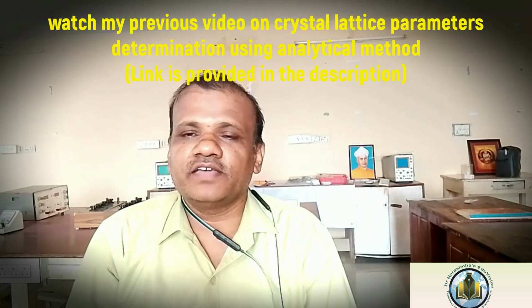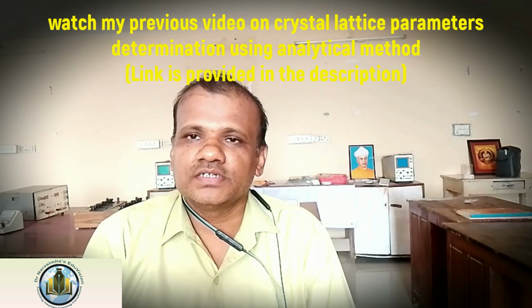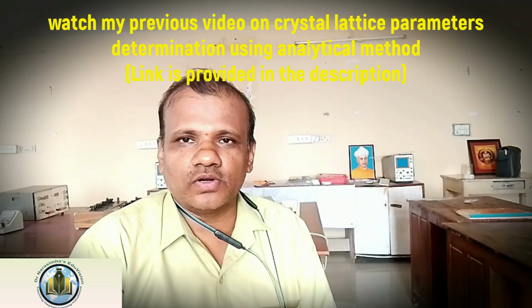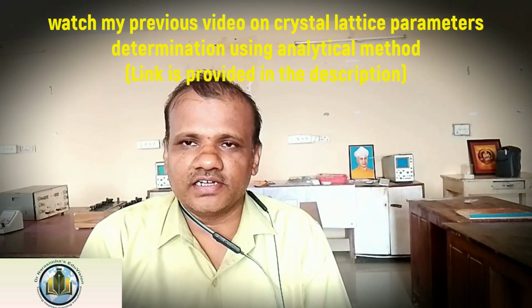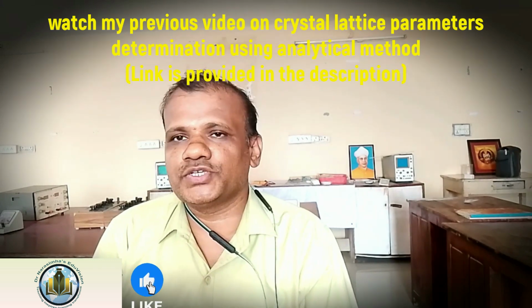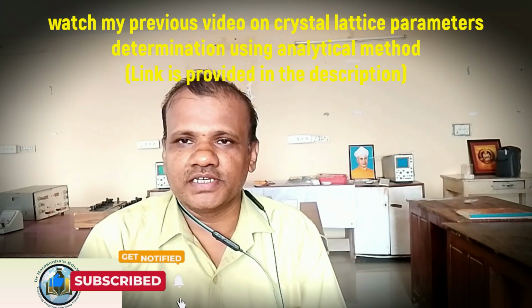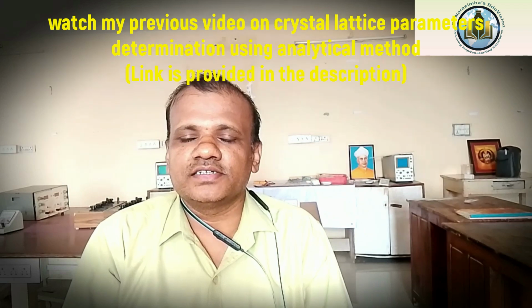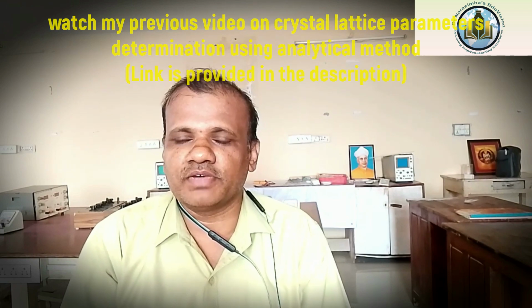So today I will show you a simple software package called powderX. The size of this software is less than 5 MB, and there is no need for licensing; it does not require a key to activate the product. By using this simple software package, you can calculate the lattice parameters, the interplanar spacing, the width of each diffraction peak, and you can even do unit cell refinement also. So today I am going to show you how to evaluate the lattice parameters by using powderX. So here we go.